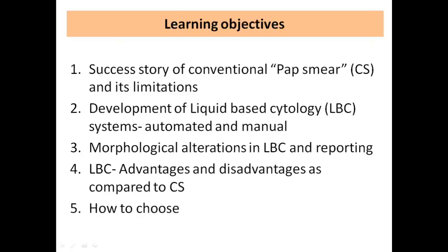Learning objectives. In this presentation, we'll be talking about the successful story of conventional pap smear and what are the limitations that led to the development of liquid-based cytology, what are the morphological alterations in the smear as a result of processing through liquid base, and what are the advantages and disadvantages as compared to conventional smear, which help us in choosing a particular liquid-based system.